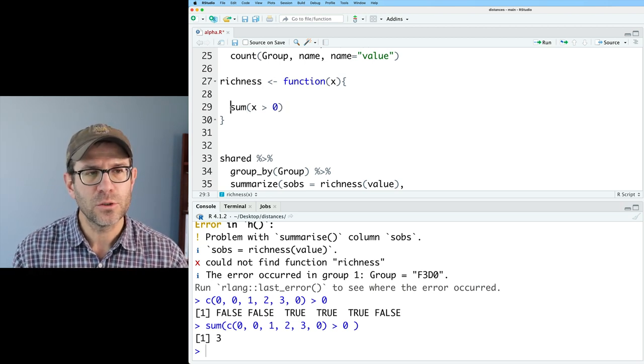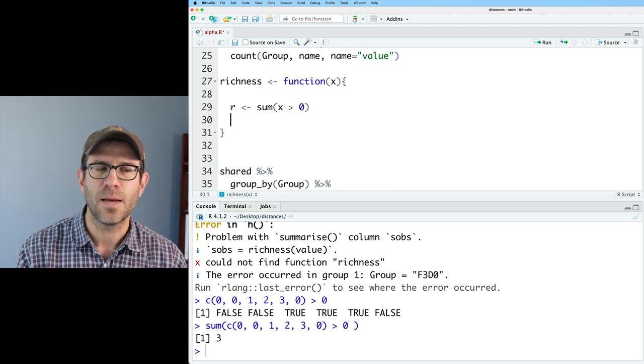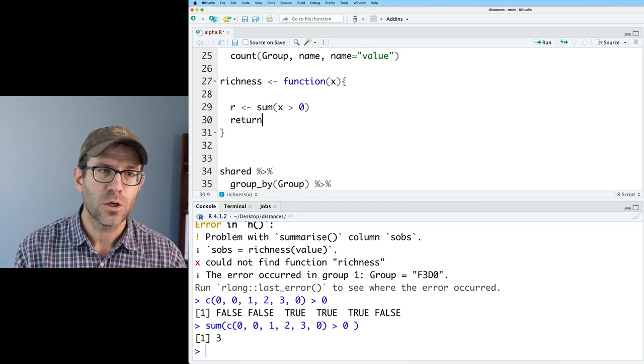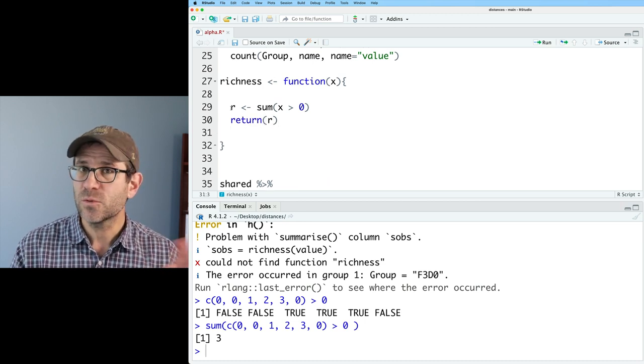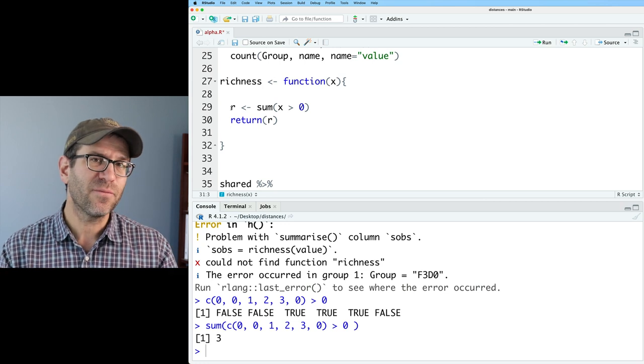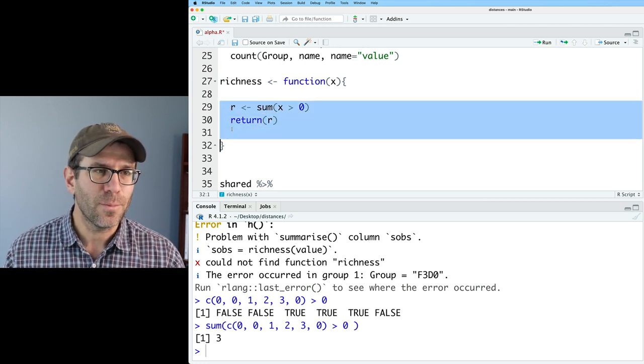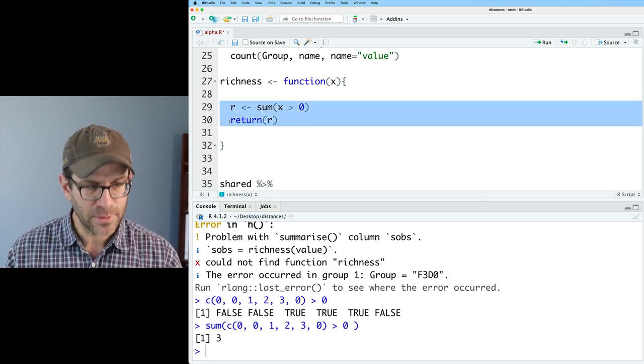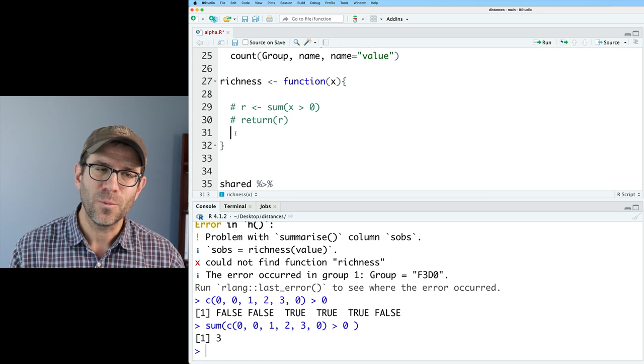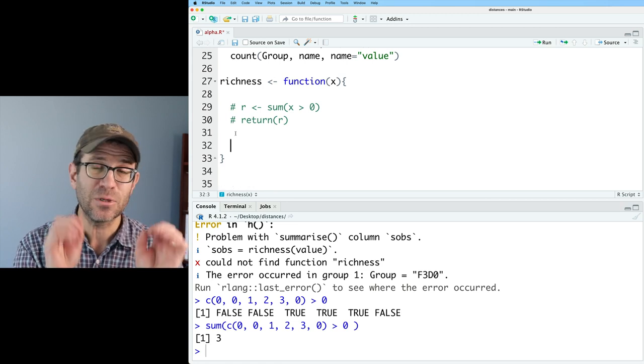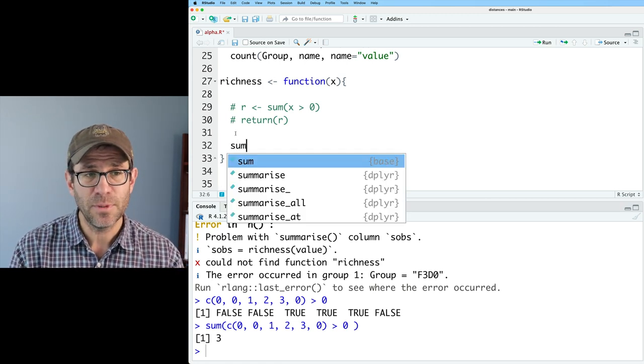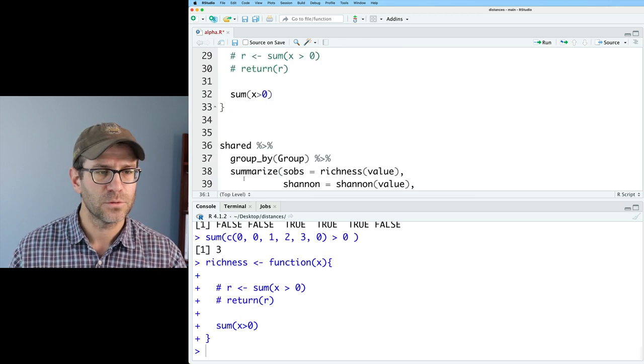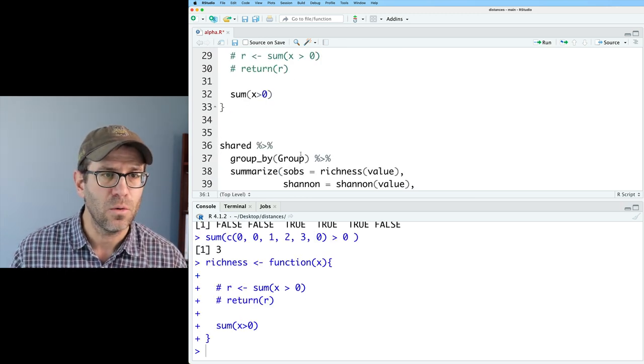And what we could do is we could say something like r equals sum x greater than zero, return r. And so this will work perfectly fine. It's a bit verbose. So I'm going to go ahead and comment this for now so that we don't have the verbose version, but the more simplified version would simply be to say sum x greater than zero. So we have that function loaded now.